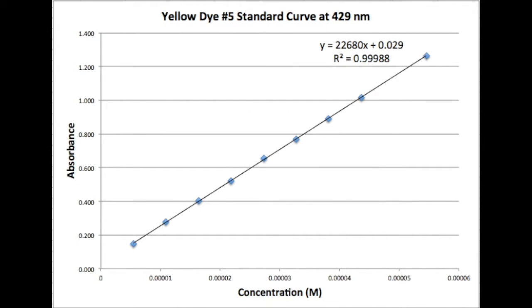First, we will briefly explain what a calibration curve is. A calibration curve establishes a linear relationship between two variables so you can determine the value of a number you plug into the derived equation. The final equation of the calibration curve is also frequently used to determine the experimental value of constants and compare it to theoretical values.